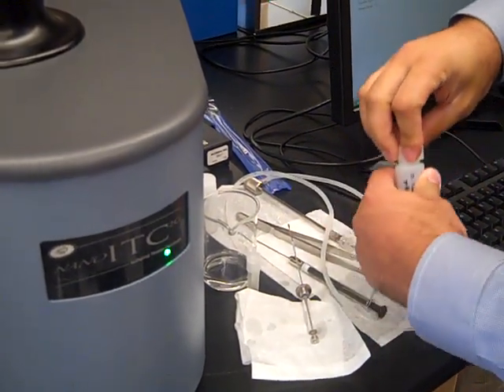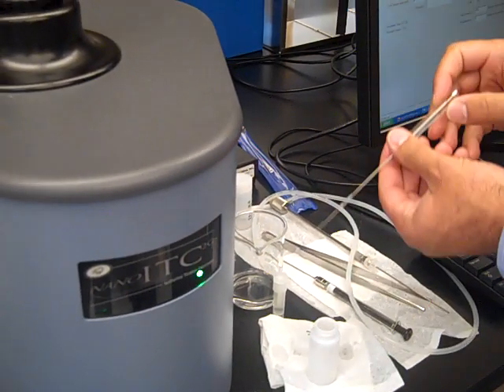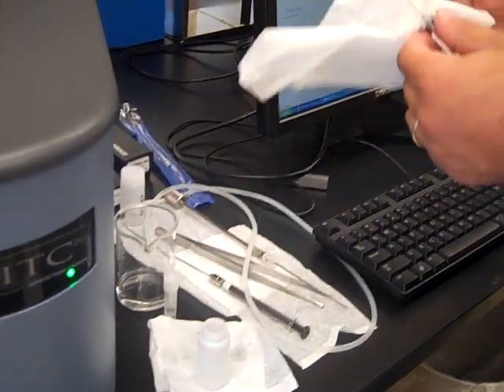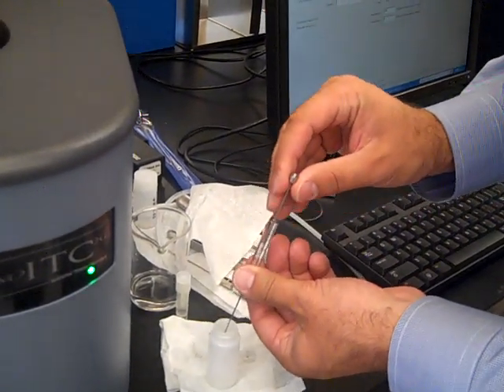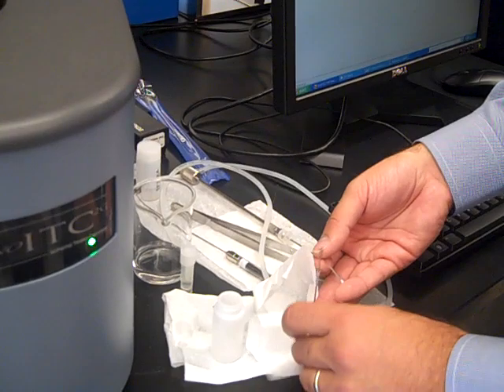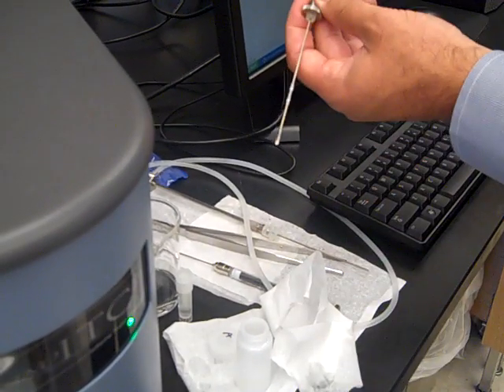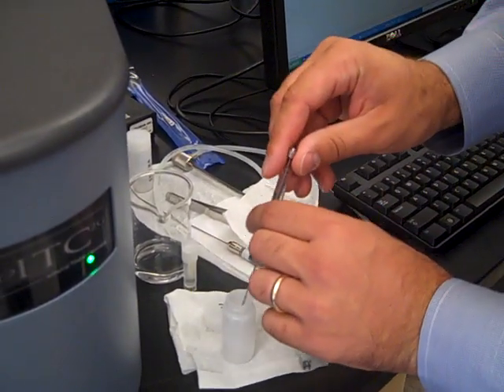So I'm just going to rinse the syringe out with a little water. Again, you can also use a dilute detergent solution to do this, and you can just drain it out. Just tap it, drain it out to the back too. You know, again, tapping gently, because you want to make sure that you wash the syringe through completely. And we can just rinse it one more time.